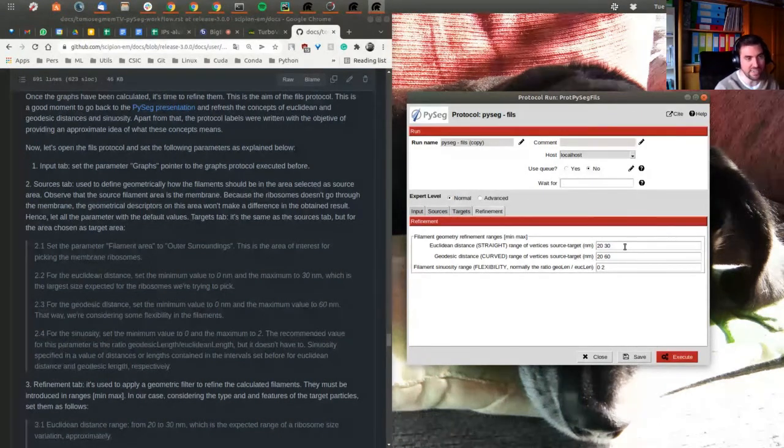And again, we can fix this straight length, curved length, and this flexibility more or less indicator. It's a little bit complex. I think it's the last complex part of the tutorial, but I hope it to be more or less clear. Let's hope it has finished and we can just set them up and execute. If you have any doubt until this point, just let me know.